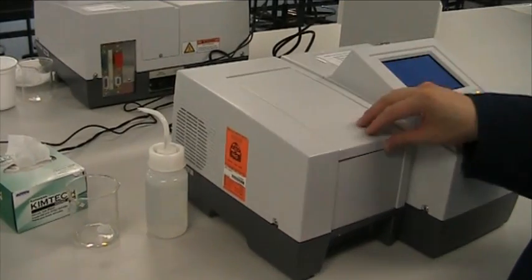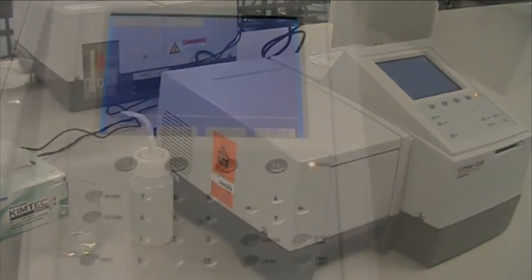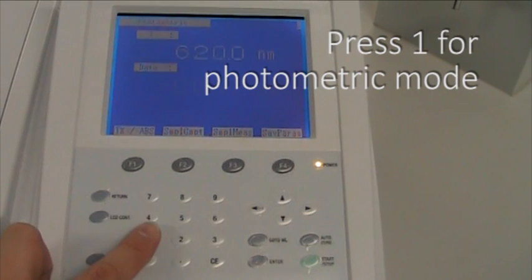Close the lid. From the main menu, press 1 to enter photometric mode.